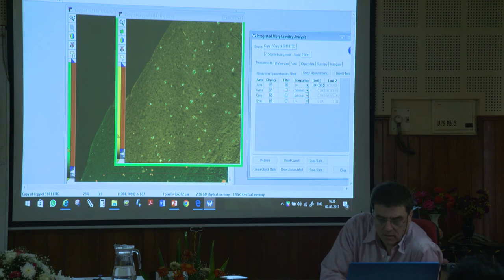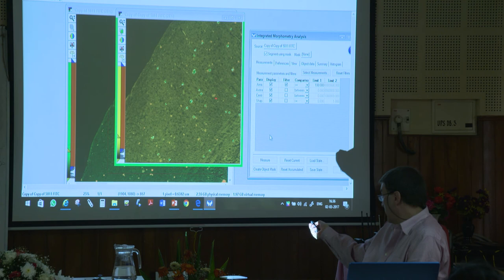Okay, so see what it did? It threw these other areas out, orange. So this would be a size sort. I would just keep these green ones, and I would call those my plaques.